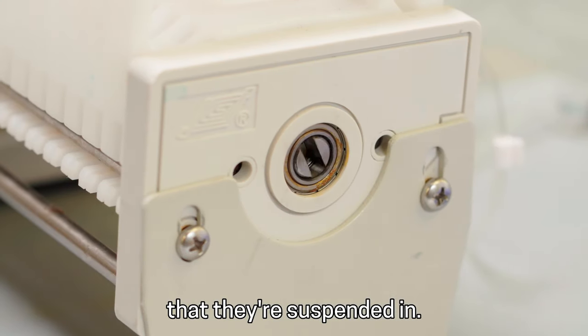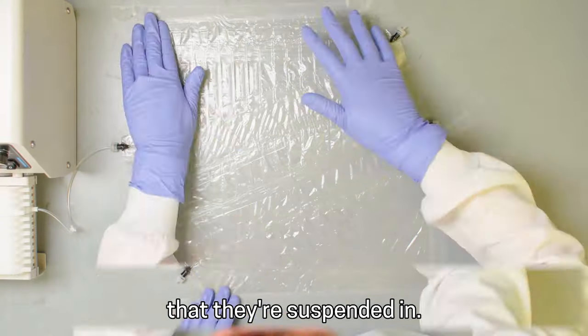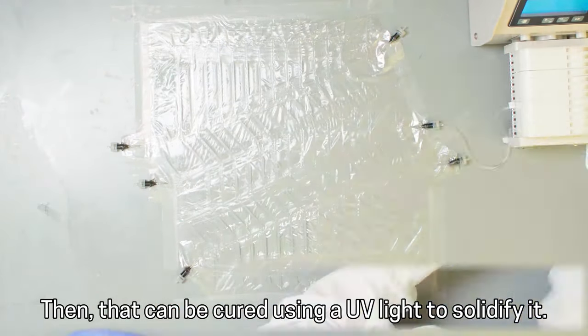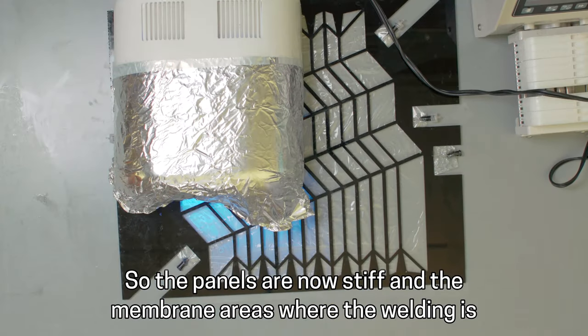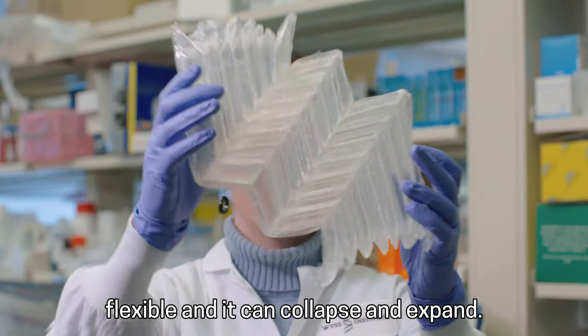Liquid drips resembling IV needles fill the network of zigzagging channels inside the layered membrane. That can be cured using a UV light to solidify it, so the panels are now stiff and the membrane areas where the welding is are flexible and can collapse and expand.